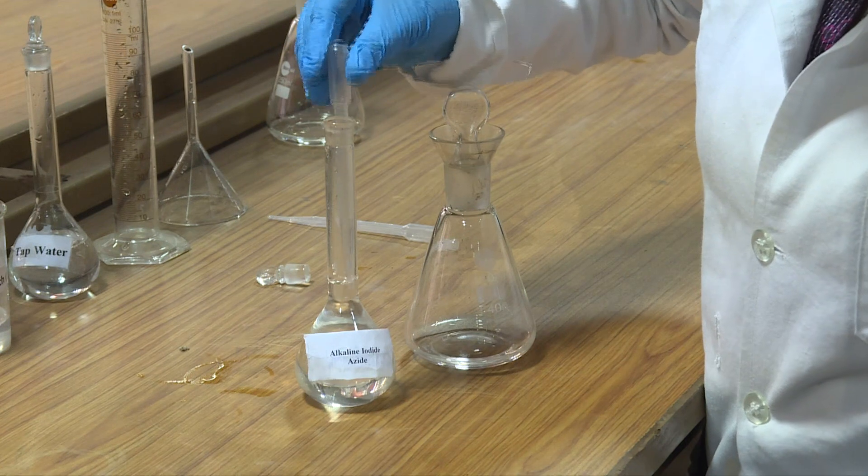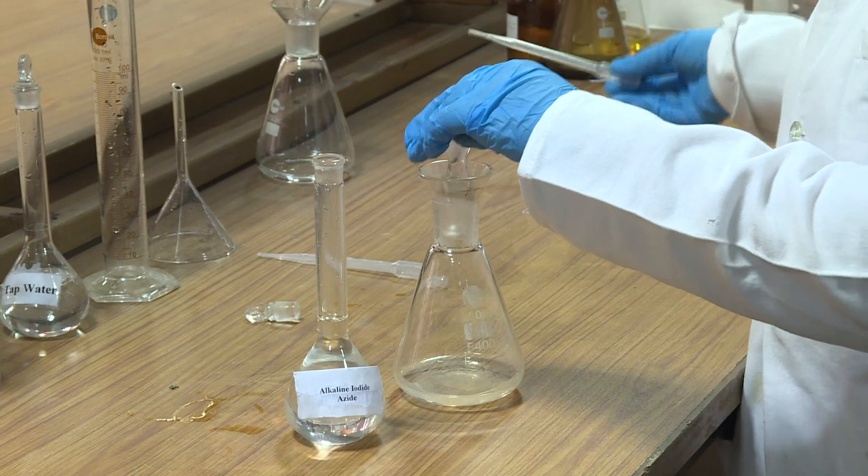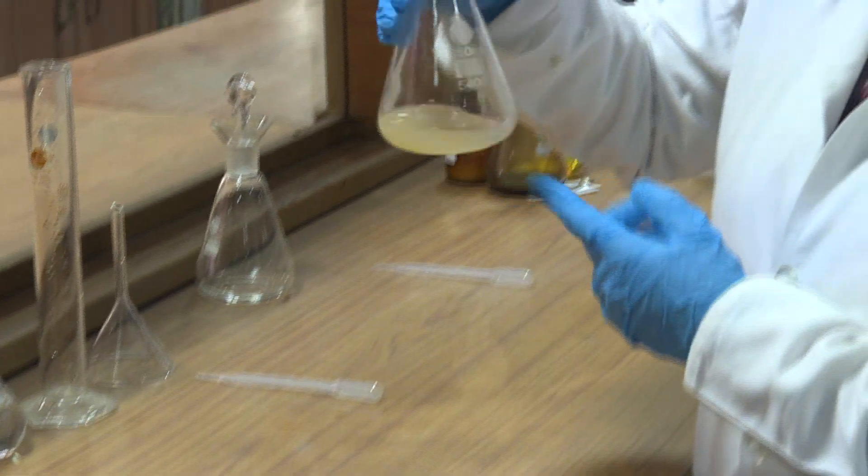Add 1 ml of alkaline iodide azide to the flask, insert the stopper, and shake it several times. Allow the precipitate to settle halfway and mix again.